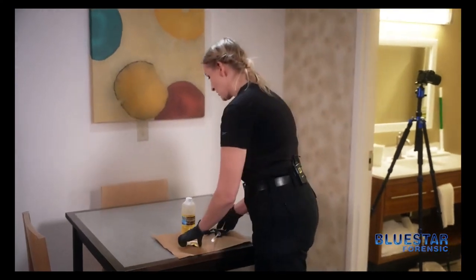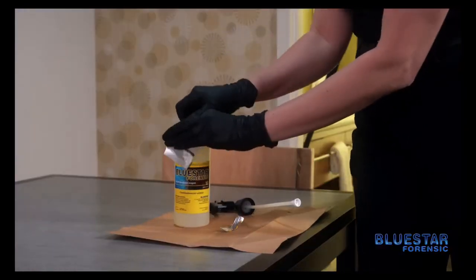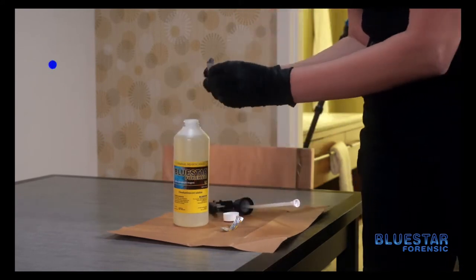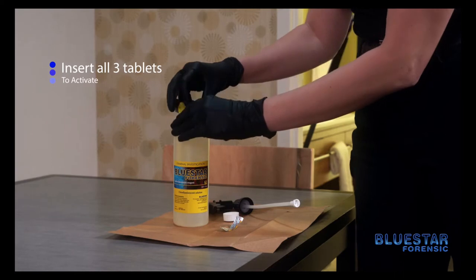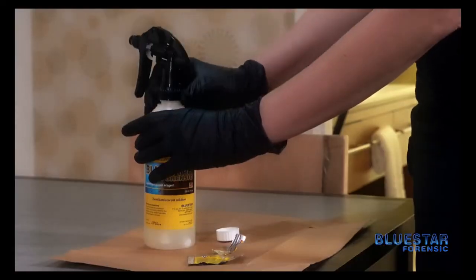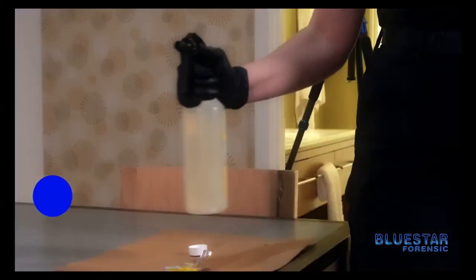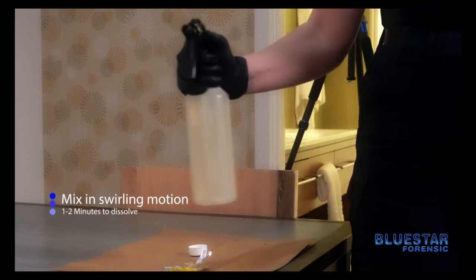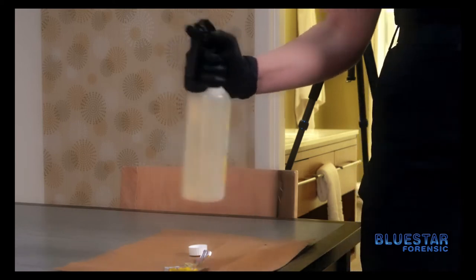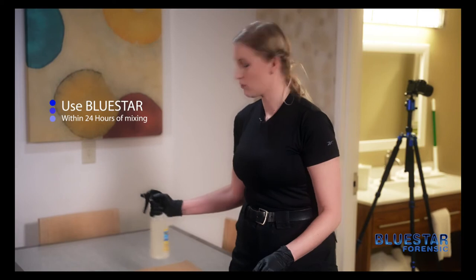The first thing that you want to do is open the foil package with the tablets. You are then going to drop all three tablets into the solution to activate it. You'll then close the bottle and mix it in a swirling motion for approximately one to two minutes so that the tablets can dissolve and activate the solution. You also want to make sure that you use this product within 24 hours of mixing.